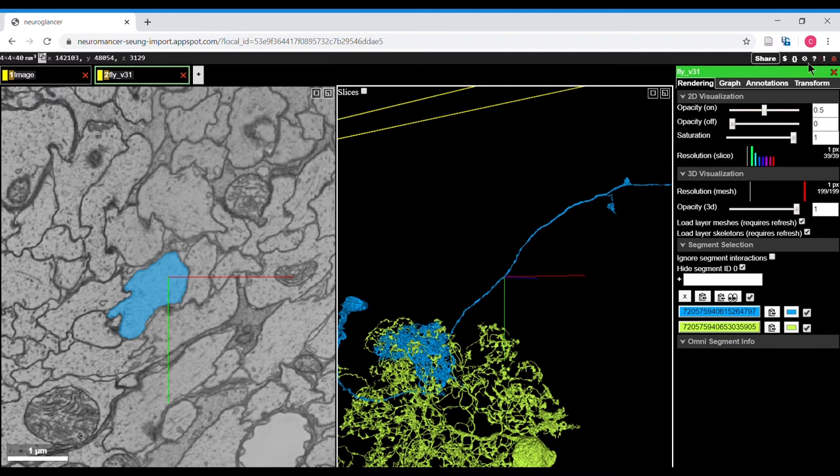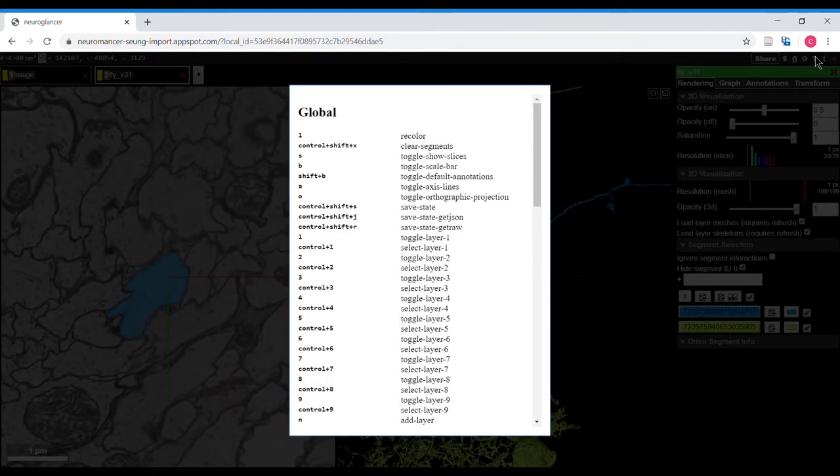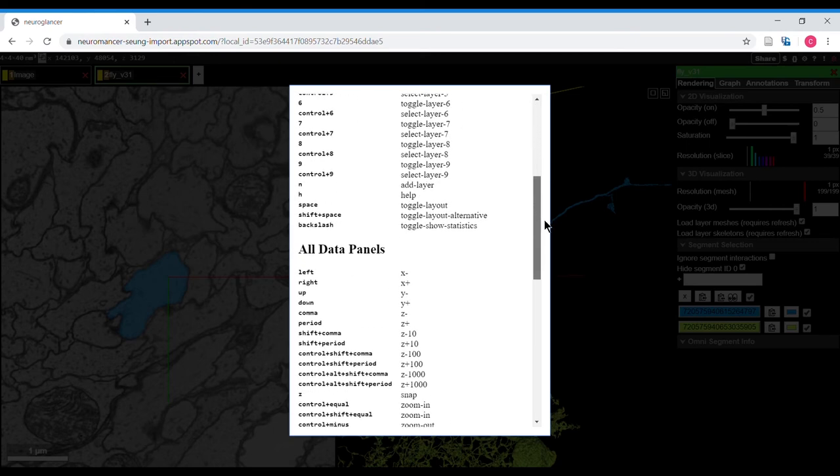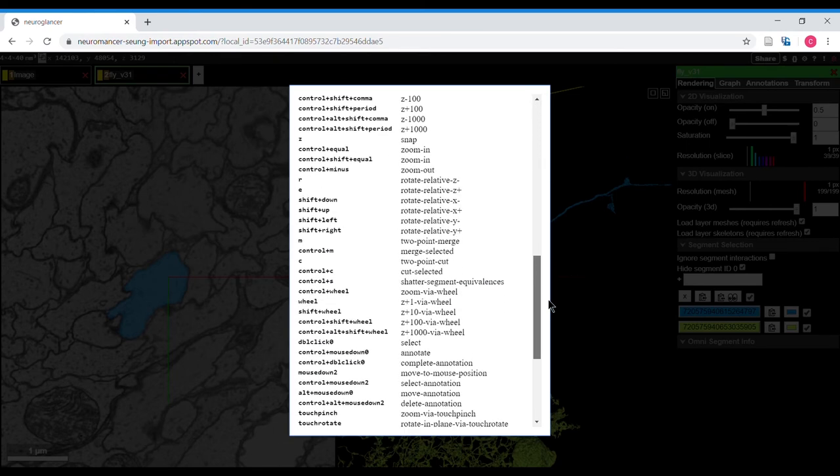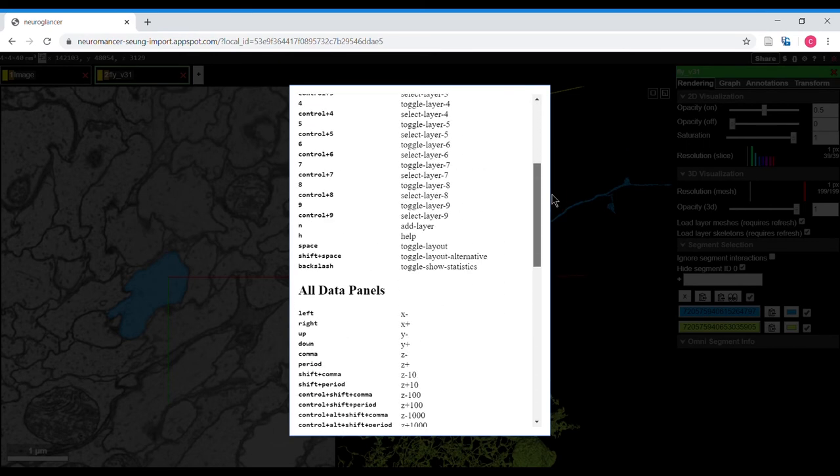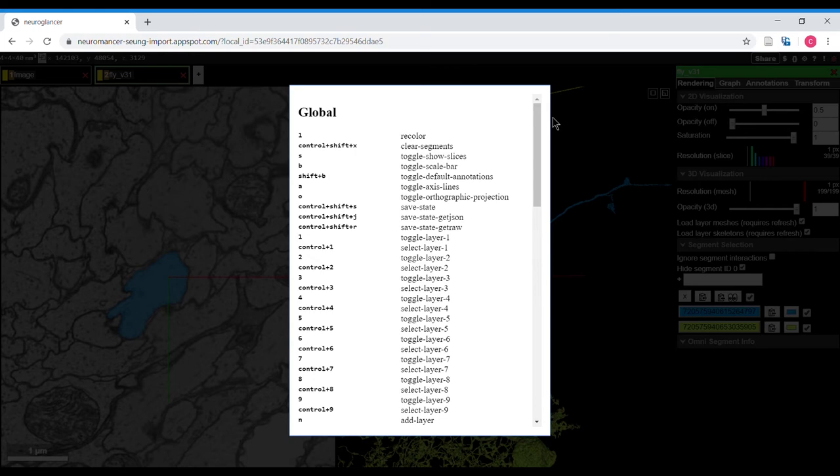The question mark icon shows quick keys for lots of different functions that you can do within the GUI.